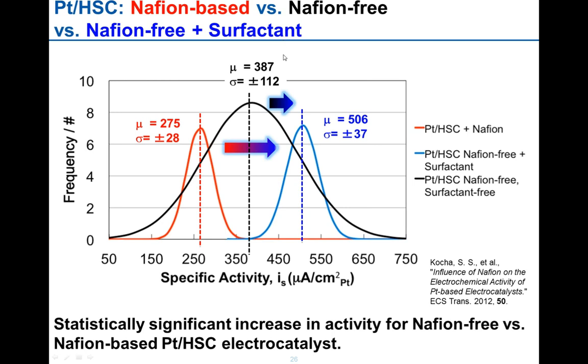We added some surfactant. What happened is I went to the lab next door, and a long time ago we had used some surfactant for PEC studies. And so I introduced a bit of surfactant in order to disperse the ink better. The result was that we formed very good dispersions and very good films. But once you put it in acid, they washed off, produced a lot of pretty bubbles too. So that did not work initially.